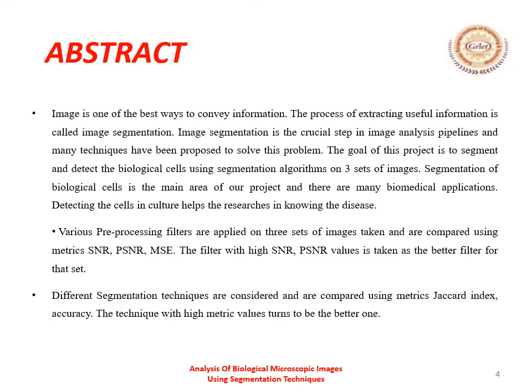We are going to use three sets of images to compare the results. To compare the results of pre-processing filters, we are going to use SNR, PSNR, and MSE. Whereas for segmentation techniques, we are going to use accuracy and Jaccard index.